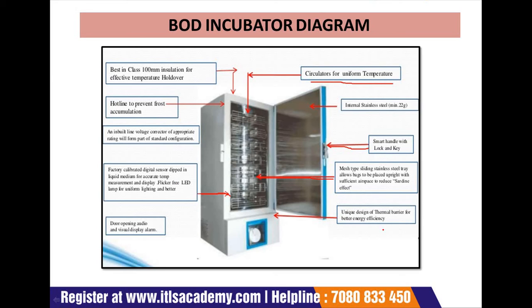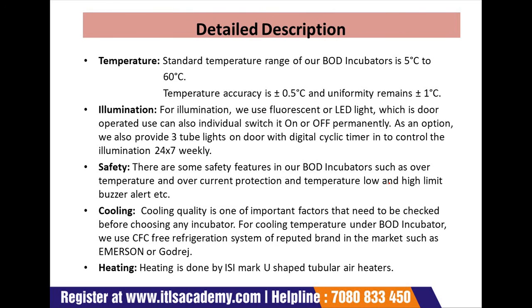So by this picture you can see the inner part and outer part both. So in these 4 pictures we try to understand the different parts of the BOD incubator. Now we will discuss the detailed descriptions about the BOD. First one we will discuss is the temperature.